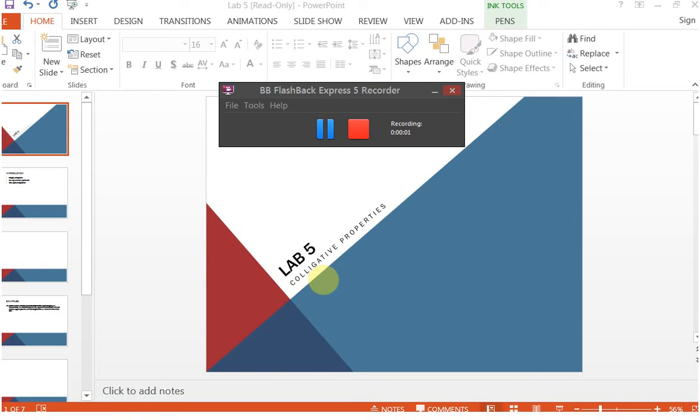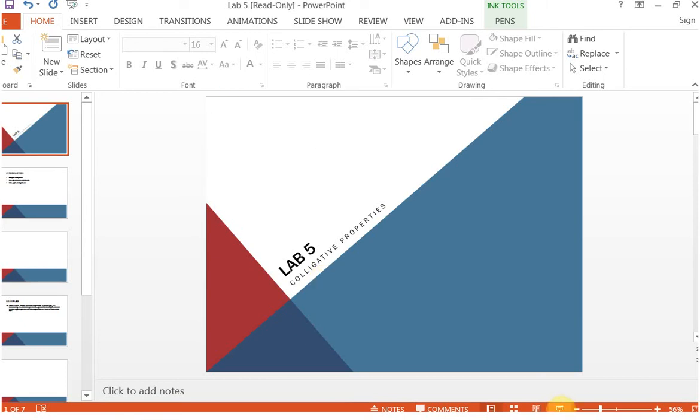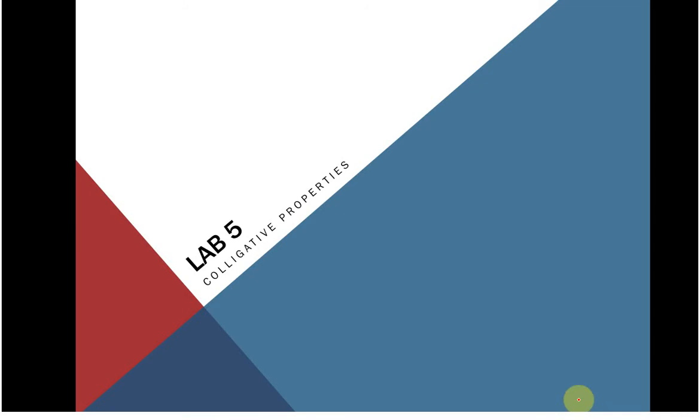Okay, so this is the video for Lab 5, Colligative Properties, and we're going to talk about just overall what this lab is about, what you can expect, and go through some example calculations.